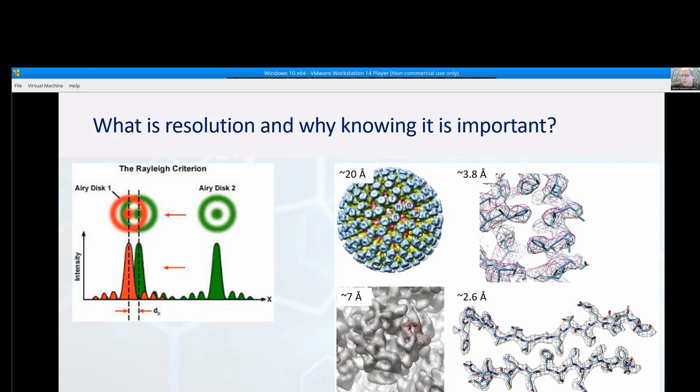I hope at that point, I would like to know, because it's very hard for me to see, whether it is clear that the problem is stated clearly. In other words, we are extremely interested in what is the resolution of an experiment. It is today, for our field, completely not determined by the behavior of the machinery. The machinery, if you would have a very good and resilient sample, would get a resolution which is dramatically beyond what we would need in order to interpret biological structures and the problems associated with them. However, due to sample limitation, our ability to extract the highest quality information from the very, very high quality machine is many times limited, and we need to interpret and decide what is the resolution that we have in our sample.